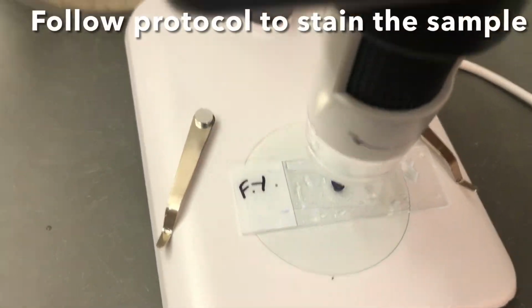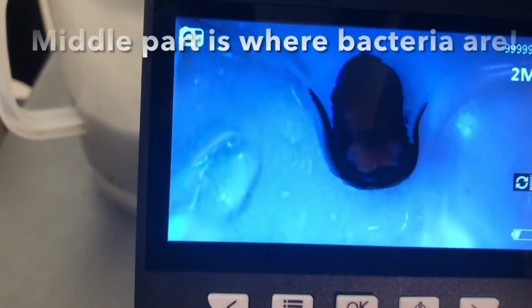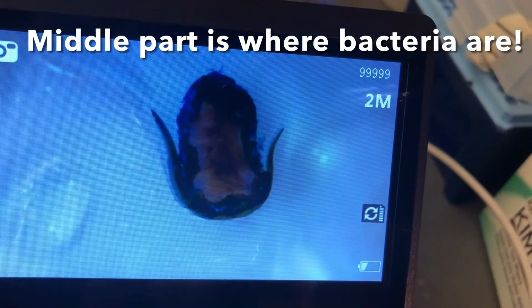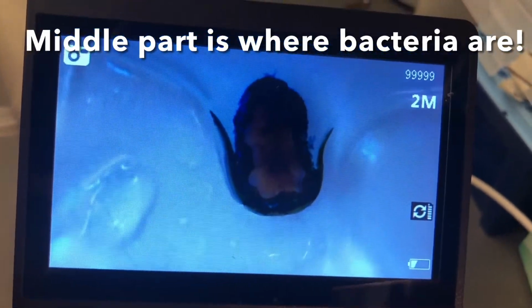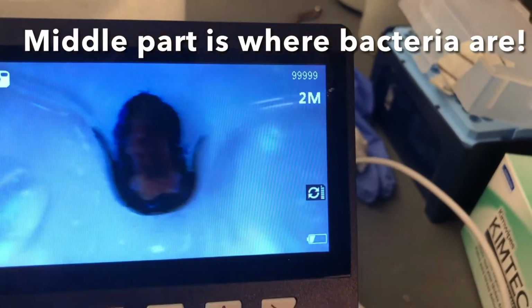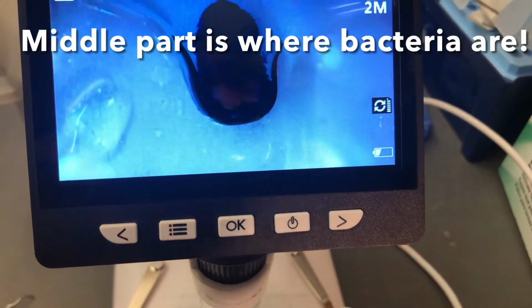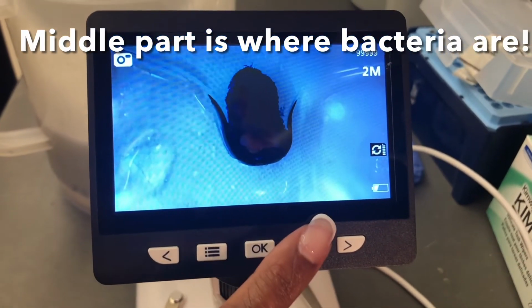So here's what it's stained, and that's what we see. Try to focus it. Around it the stain picked up, but the middle part didn't take up the stain. Take a picture. All right. Okay, that's good.